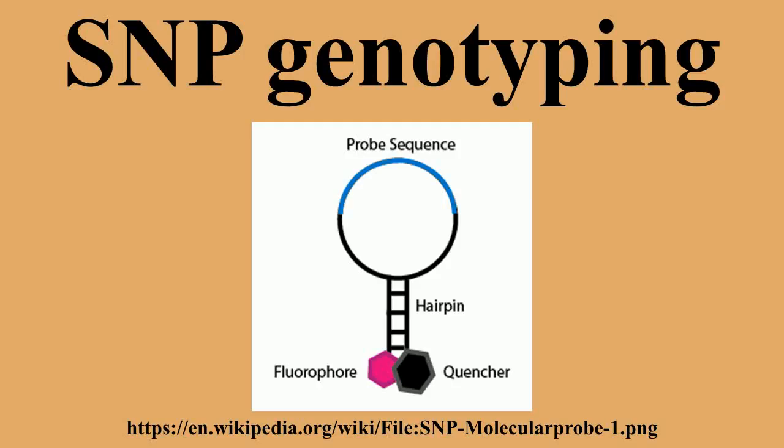The basis of the invention is that unexpectedly, oligonucleotides with a mismatched 3' residue will not function as primers in the PCR under appropriate conditions. As a result, if a given allele is present in the PCR reaction, the primer pair specific to that allele will produce product, but not the primer pair for the alternative allele with a different SNP.